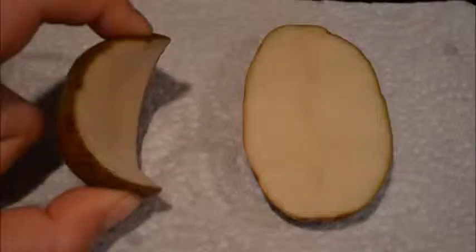The loss of water to the cells has resulted in loss of cell wall turgidity, making the potato pliable, easy to bend between your fingers. The potato in water did not burst because the cell walls prevent this from happening. This shows how dehydration contributes to the wilting of plants.